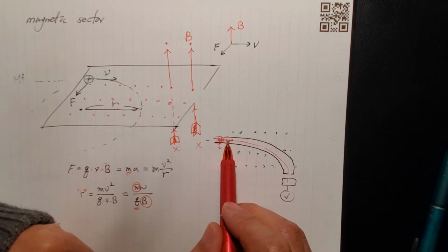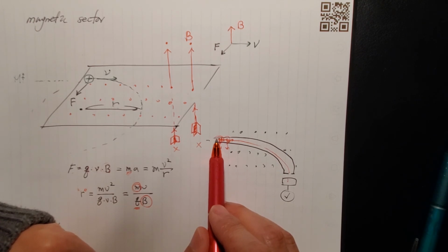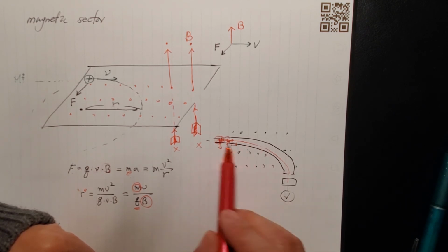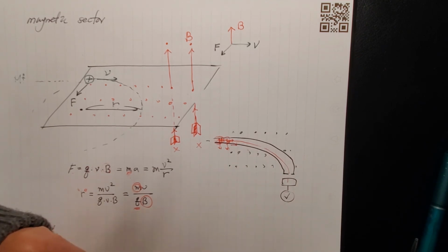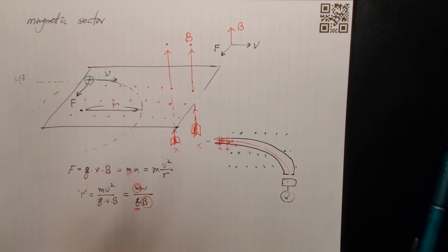But what happened to the lighter one? Well, the lighter one got much more acceleration in this direction, so it's curving much and runs into the metallic piece, and there you have an electron given to it, and it's getting reduced and just disappears. It's not an ion anymore. It cannot bounce back and fly again. It's going to be just neutral.